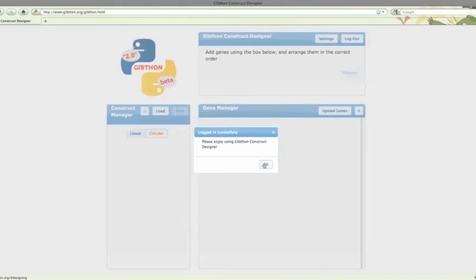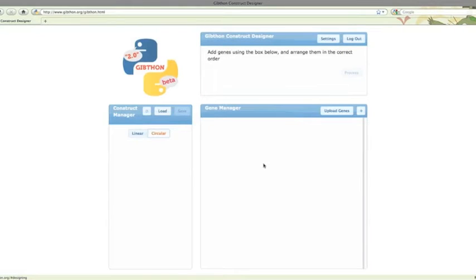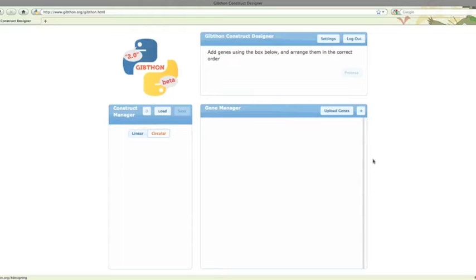Note that all of these are biobrick parts. You can also upload your own parts in GenBank format or take parts from the Nucleotide database. This also isn't a complete arsenic biosensor, but it should give you the idea of how things work.